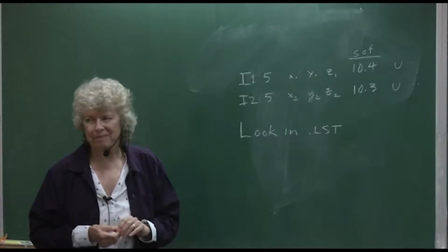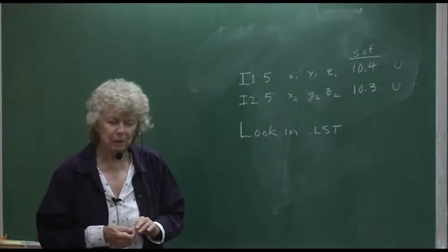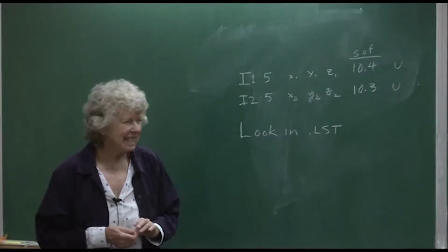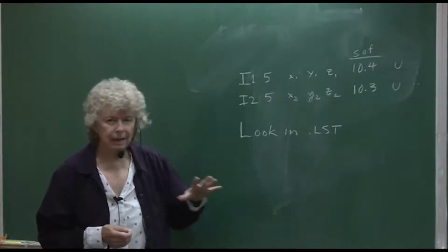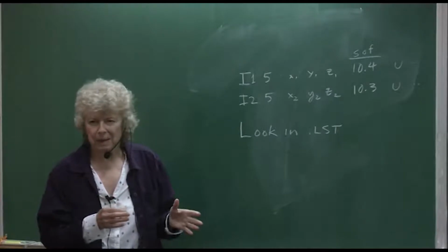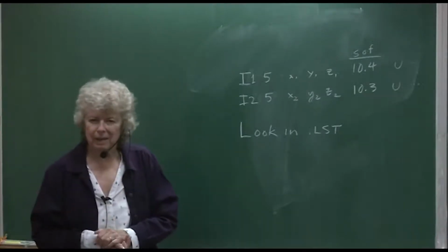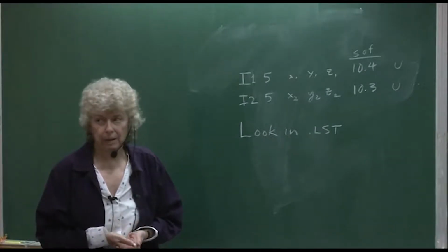Because the symmetry is generating the other halves or fourths of the molecule. The LST file also, of course, after you've said ACTA, gives you what you've put in the unit statement and what is actually there in the units. So that's another double check that you get it right.